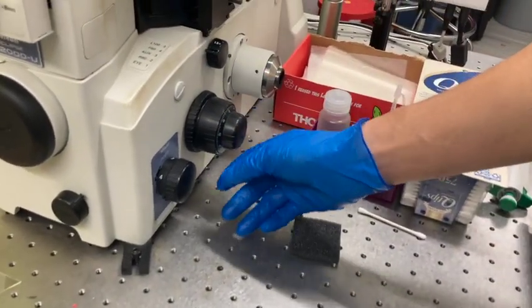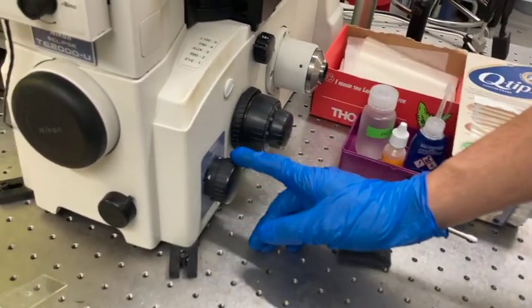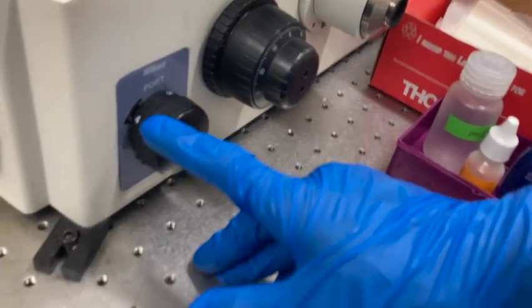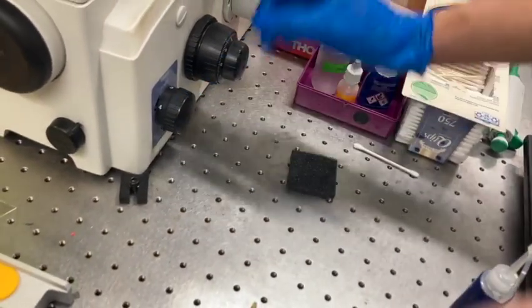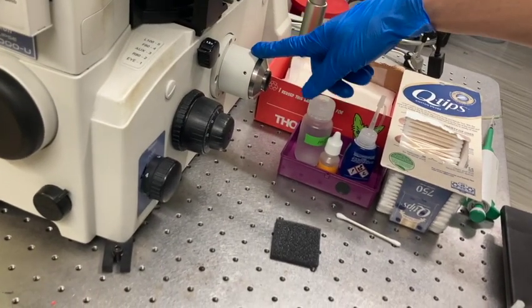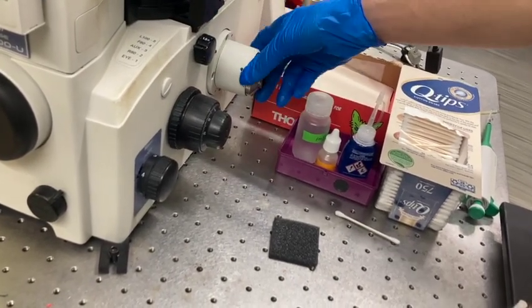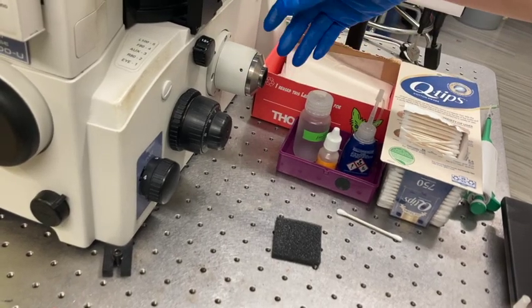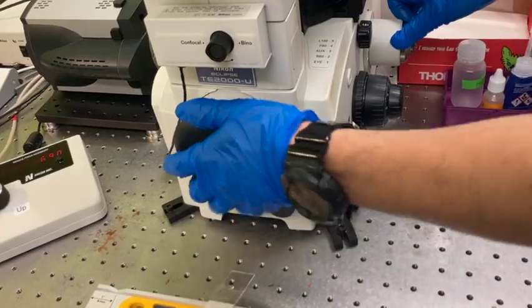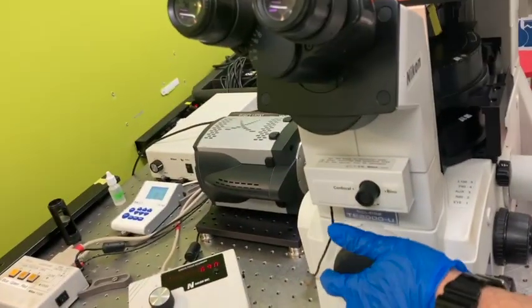So yeah, this is to adjust the focus. This is obviously to switch between the ports. So we have one port here. This port is for connection of a camera. We can connect a camera here, and also we can connect it here. And also right now we have it on the left side.